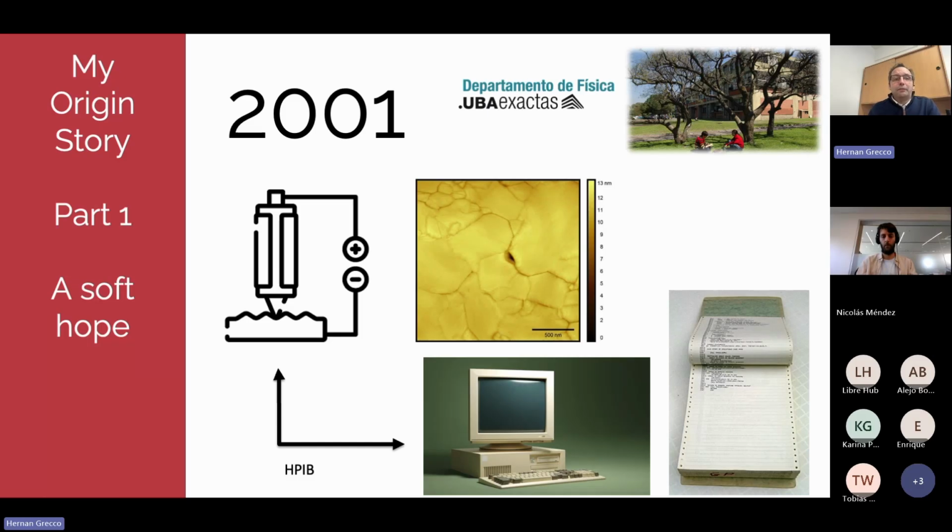That was great. And one of the things that I want to mention is that the company at that moment gave us the source material. Therefore, we were able to rewrite the software once the company stopped supporting that computer. And therefore, the instrument, which was really good quality, we were able to bring 10 or 15 years to the future and continue operational.